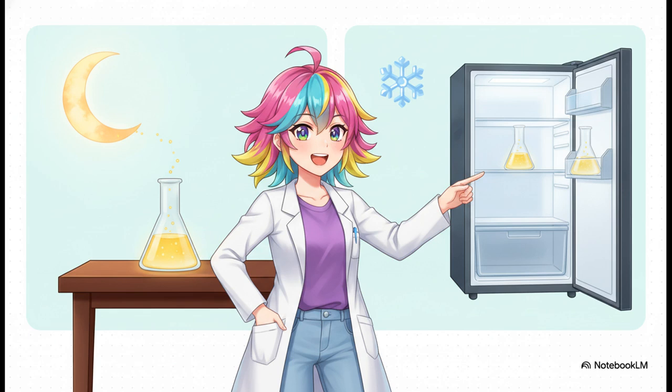However, researchers have successfully validated a modified rapid method where the sample simply settles for 3 hours inside a standard refrigerator. The results? It's a massive, game-changing time saver while still maintaining an incredible 98 to 102% accuracy recovery rate. It makes it perfectly suitable for quickly advising consumers without that frustrating 2-day delay.